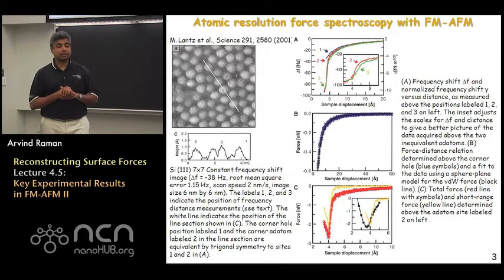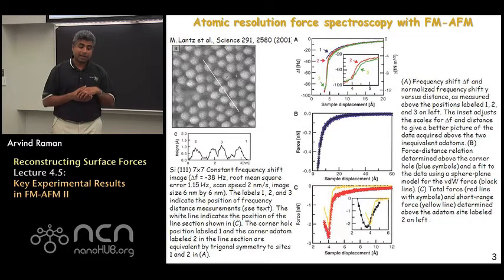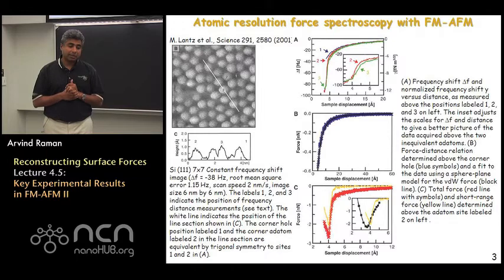Remember, I talked about the fact that contact mode AFM imaging at atomic resolution typically did not use reactive surfaces because the interaction forces would become rather large. So the question came up: can FM-AFM be used to quantify the interaction forces between a silicon tip and a silicon 111 surface?